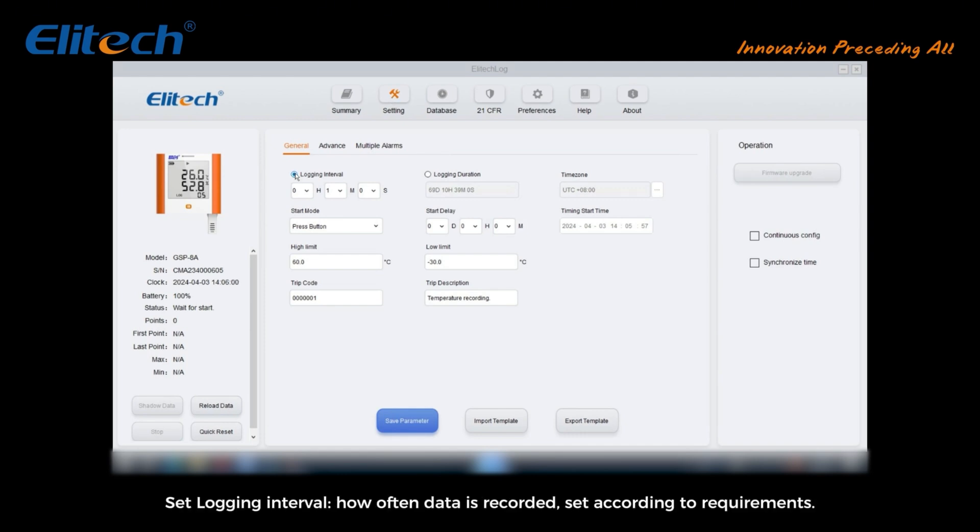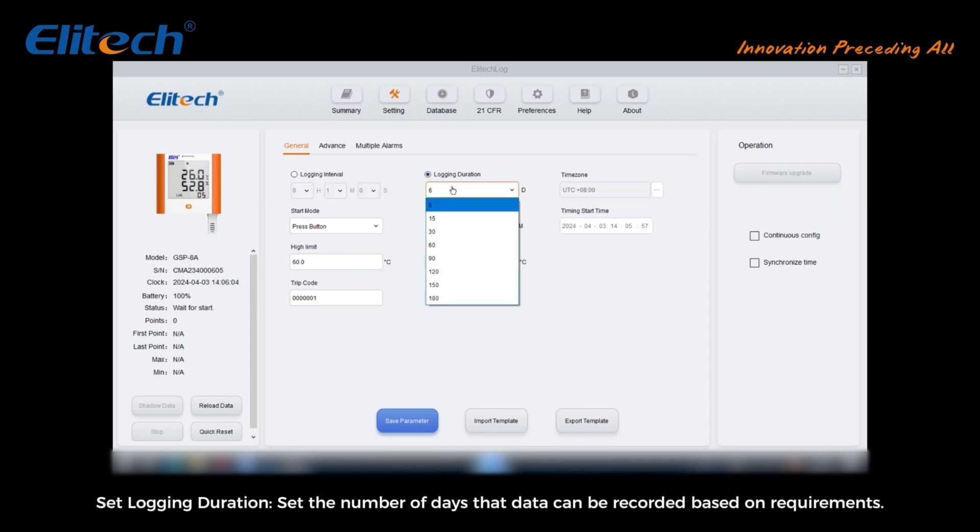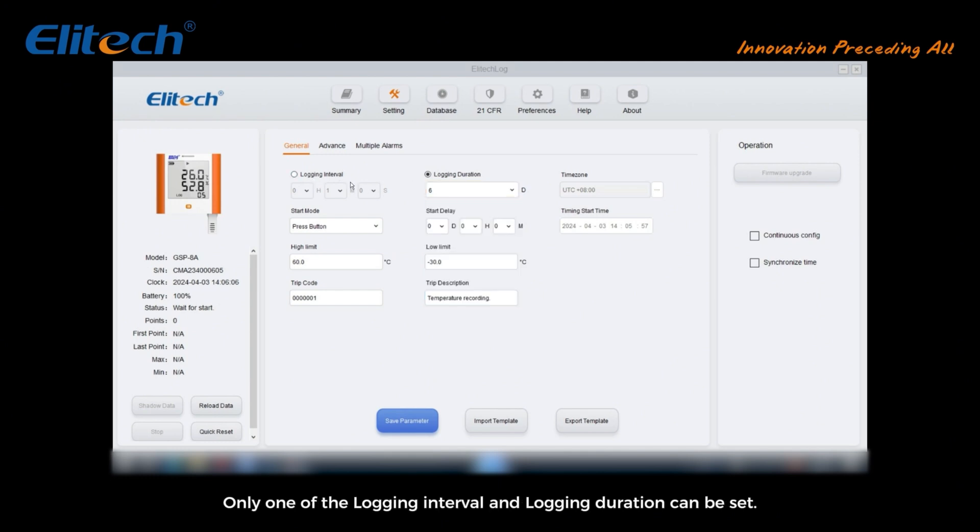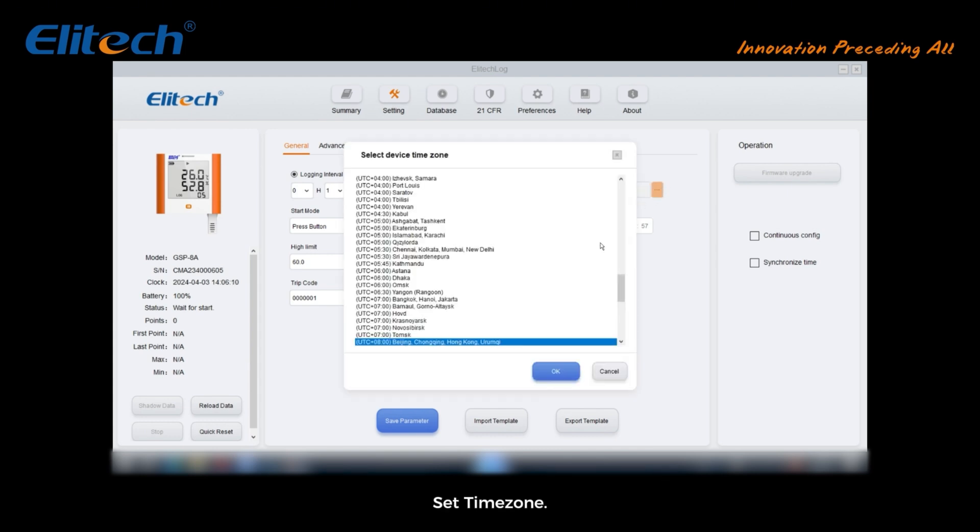Set logging interval: how often data is recorded, set according to requirements. Set logging duration: set the number of days that data can be recorded based on requirements. Only one of the logging interval and logging duration can be set. Set time zone.